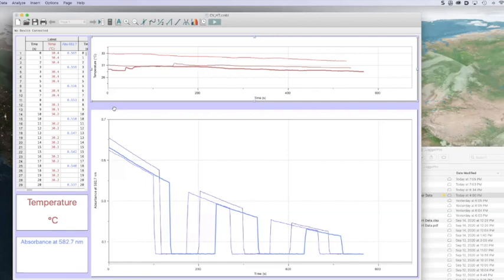When that happens, the rate is constantly changing as your experiment is running, because the temperature is changing as well. As the temperature changes, the rate also changes. So this temperature profile at the top tells you that the drift is not actually that large, and you can take an average. That's the key.